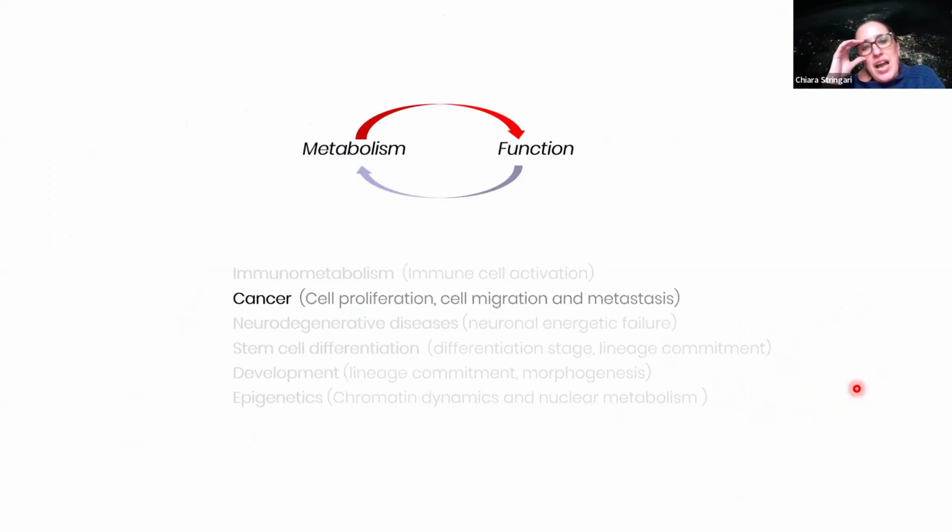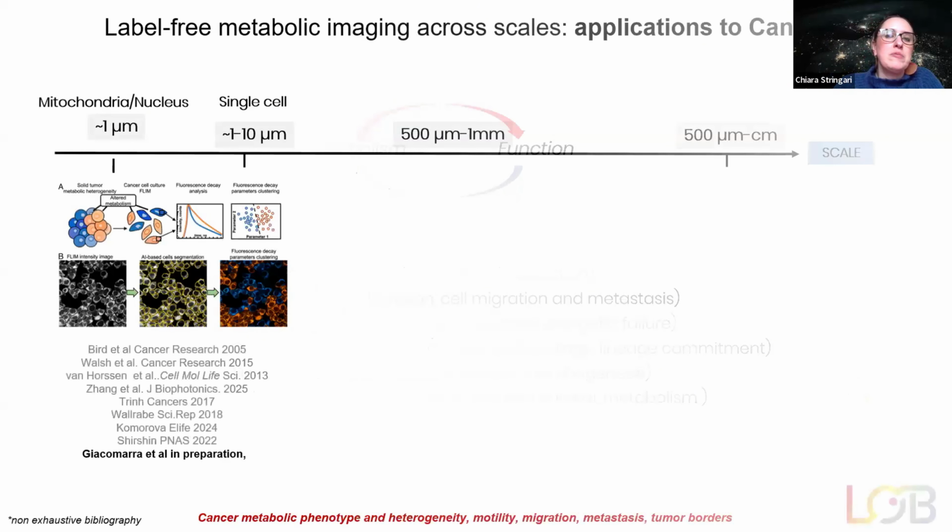So to finish, I want to highlight some other applications in the field. I cannot cover everything because it's too much, but I just want to highlight what the community has done with metabolic imaging in cancer. And of course, metabolism is very important in cancer.